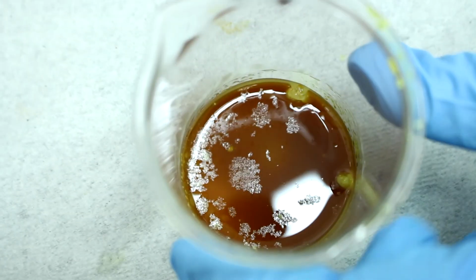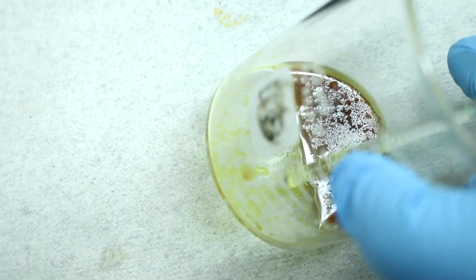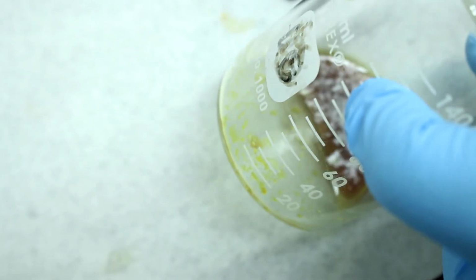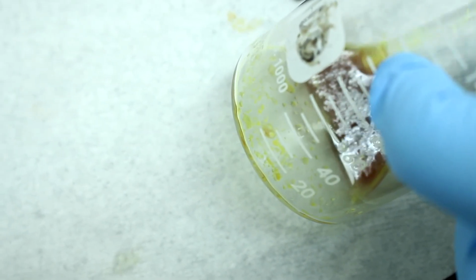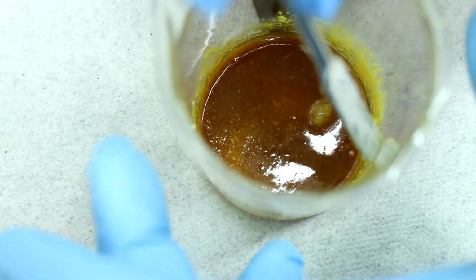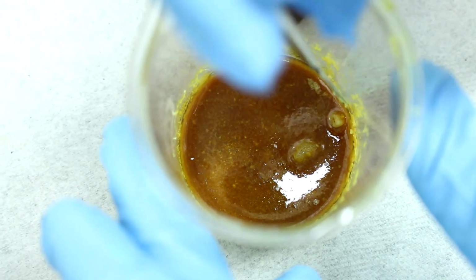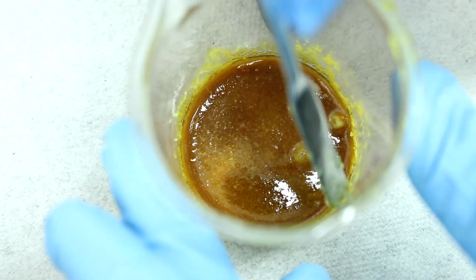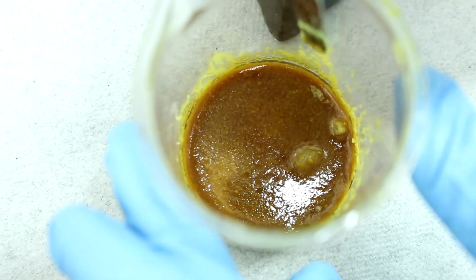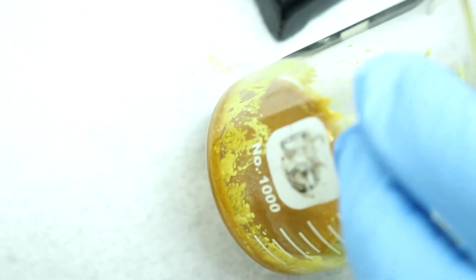I mean, you can kind of see when I tip it, the residue here is oily. I don't know if that's the anisaldehyde. Not really. See, look, it almost looks like it's biphasic here. It's more akin to removing the solvent at this point than actually recrystallizing. Yep, and there you go, solidified.